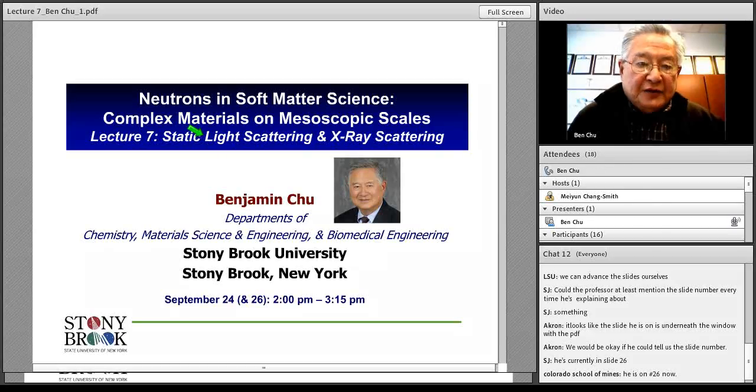H is equal to 4 pi squared n0 squared divided by lambda to the 4th, and Avogadro's number, then (dn/dc) squared. In there, the thing that's of importance is really lambda to the 4th power. In other words, the wavelength of the incident radiation, which is impinging upon the sample, and that H optical constant has a lambda to the 4th dependence in the denominator.